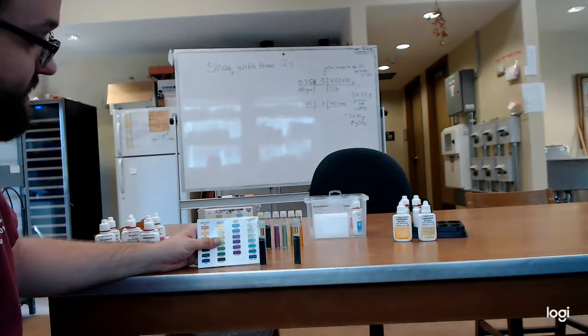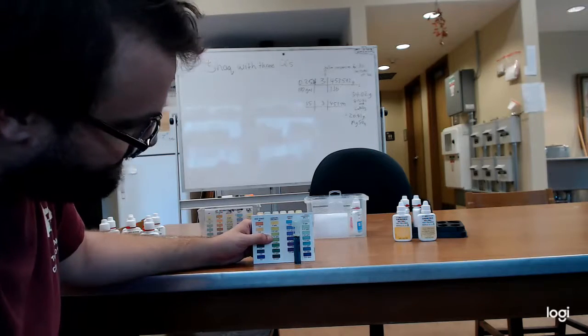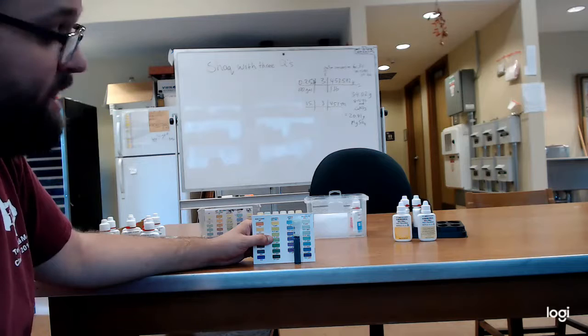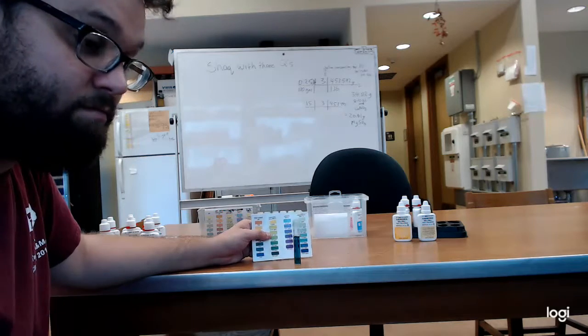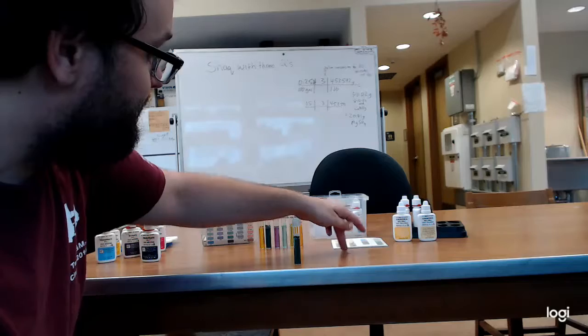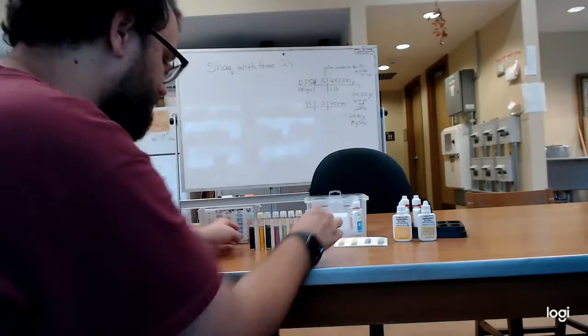We are off the charts, as they say. Whereas in our compost, we're at about somewhere in between 2 and 5 parts per million. And again, that is just phosphorus that is leached out of a compost that was made water soluble by vermicastings, by earthworms.